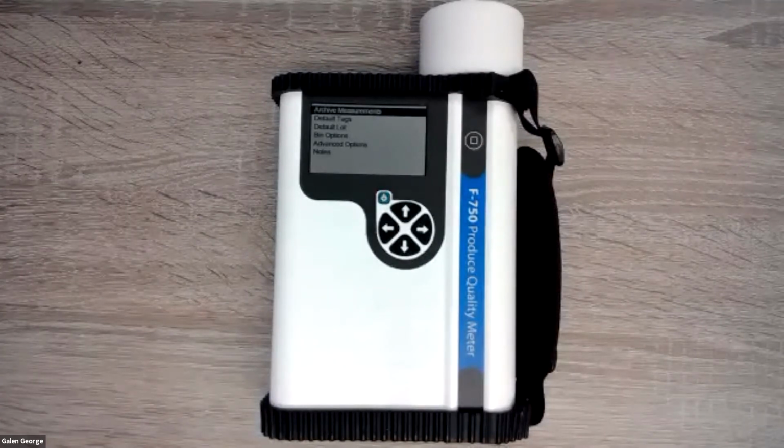The way we've developed this new generation of instruments is that every time you are done collecting data, the user should be archiving their measurements. This feature allows people to archive measurements directly to the SD card. It could be programmed to send data directly to a data server or across Wi-Fi to fruit maps.